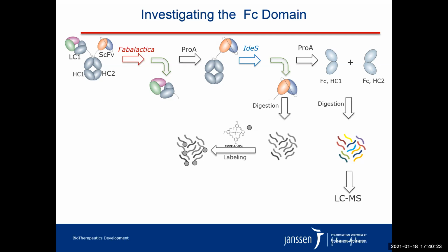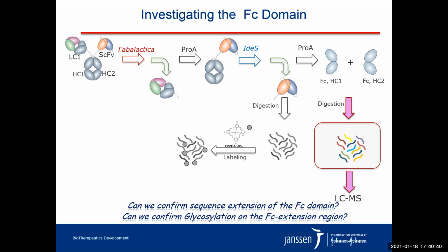These experiments did not show any evidence for scFv linkers to be modified, neither did they show the presence of the extended sequence N-terminus of the scFv. Therefore, we shifted our search of this modification to the Fc domain. We want to confirm the sequence extension of the Fc domain and confirm that the possibility of glycosylation is present due to the extension.